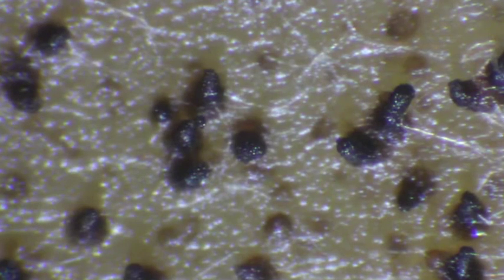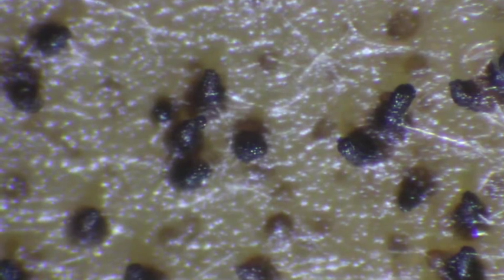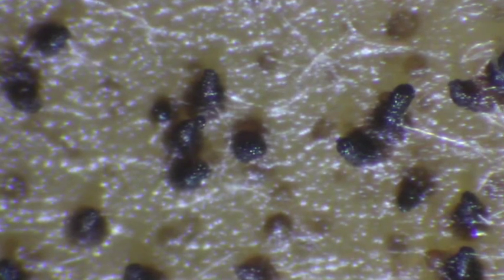You can see all of the fine hair-like structures in there. Those are the hyphae. You don't necessarily have to remember anything about the hyphae. You don't have to remember the word perithecium or anything. What you really need to understand is that these are mushrooms. Inside these mushrooms are spores. And we will be examining the spores in a few minutes when we make a wet mount and look at them under a compound scope.